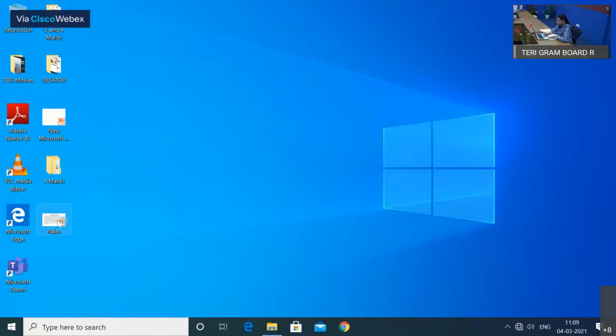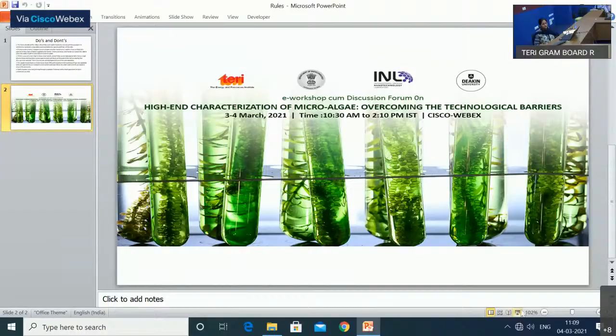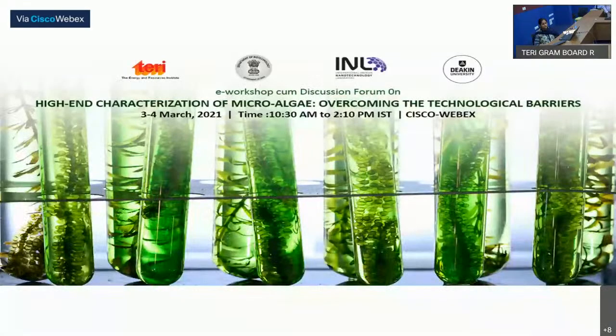Okay. So if you have some bacteria which is competing with the algae, you need to first purify that culture and then inoculate. So I don't think that it should be a problem growing in a solid medium.